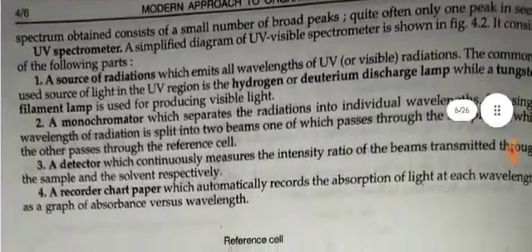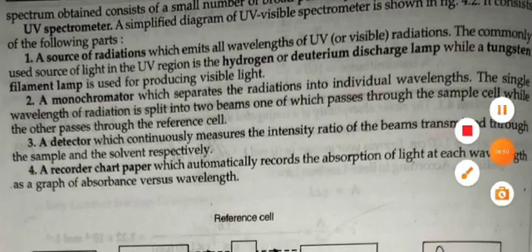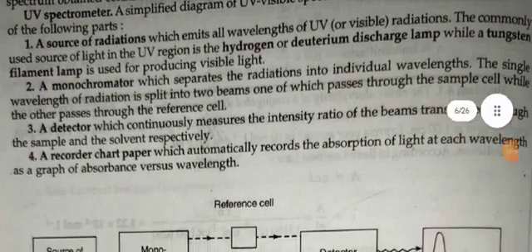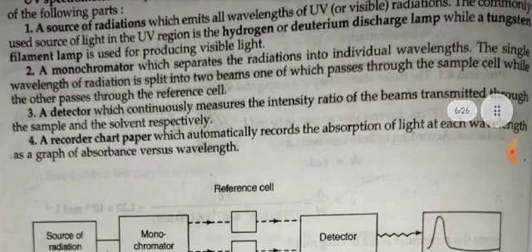UV spectrometer. A simplified diagram of a UV spectrometer is shown below. It consists of the following parts: a source of radiation which emits all the wavelengths of UV radiation. The commonly used source of UV radiation is a hydrogen or deuterium discharge lamp, while a tungsten filament lamp is used for producing visible light. A monochromator which separates the radiation into individual wavelengths.